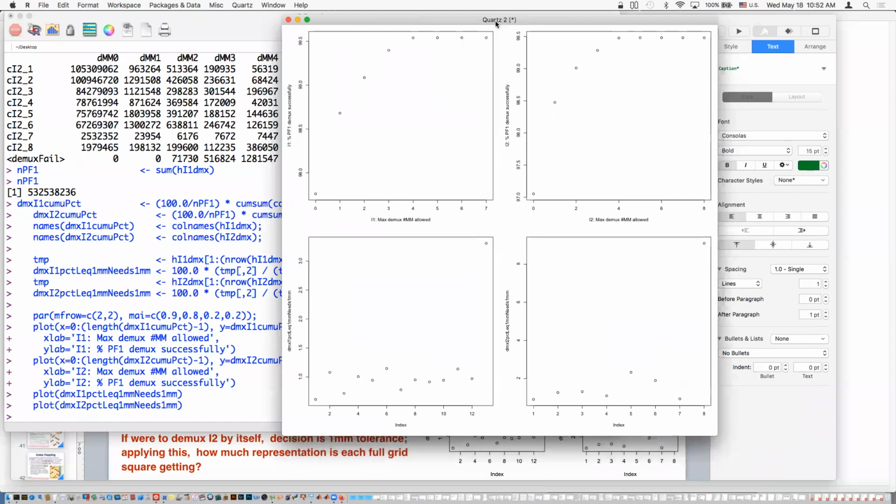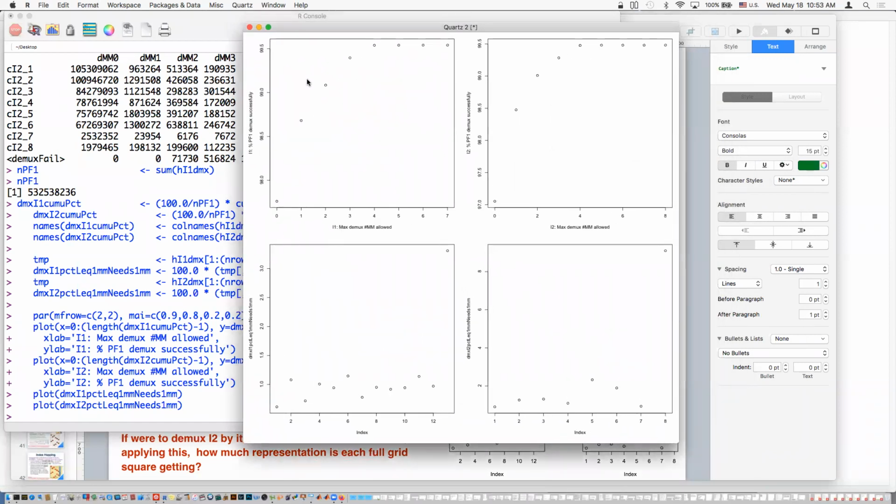There we go. All right. So what do we got here? We got the lane overall recovery on the top, and we got the per target view on the bottom. And what's the story? Well, you always got to look at the y-axis too. So the per lane recovery benefit from one mismatch only goes to 3%.